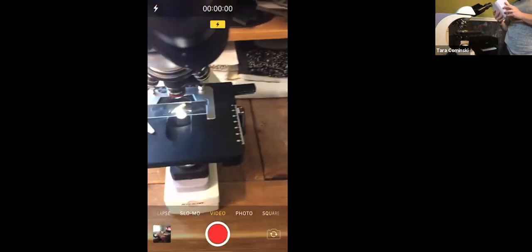All right, so these are the onion cells. Right now it's under scanning, so under 4X. So you can take a little look at what this looks like. And those round circle things that you see are air bubbles. It's going to be kind of hard, like I said, that's why I said use the pictures to describe. But you're not going to really be able to.